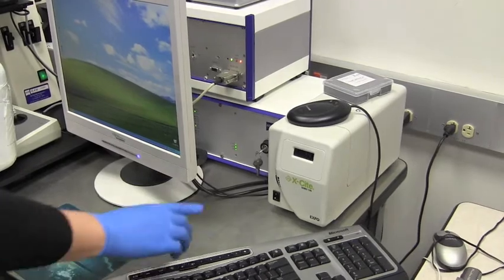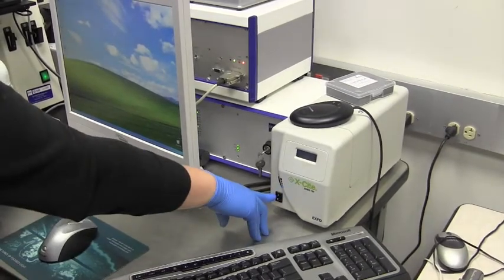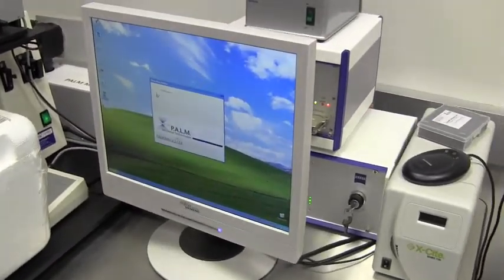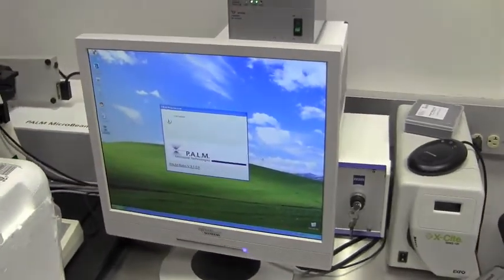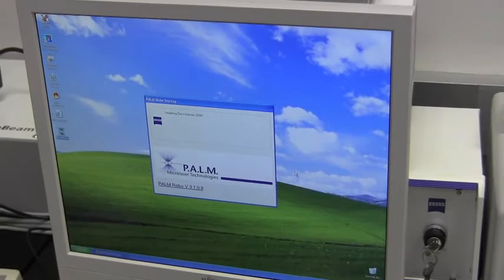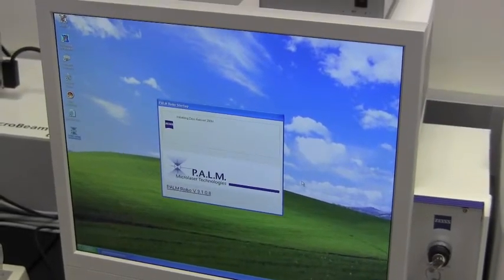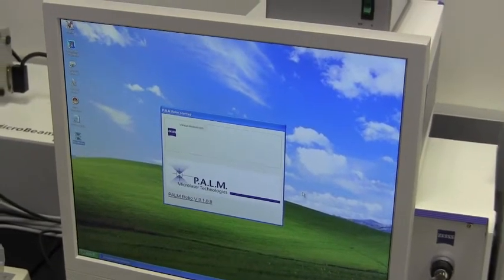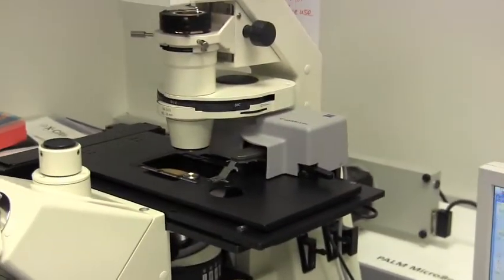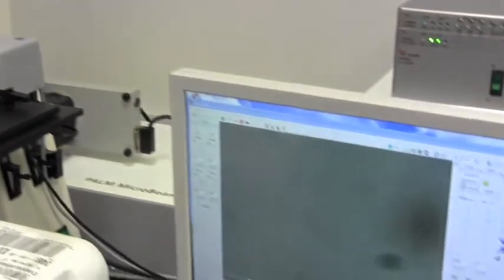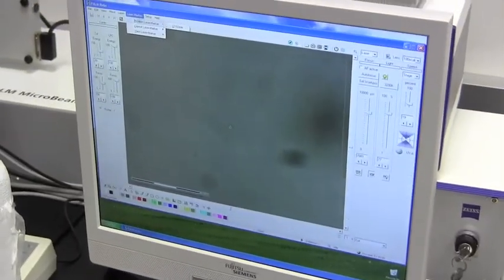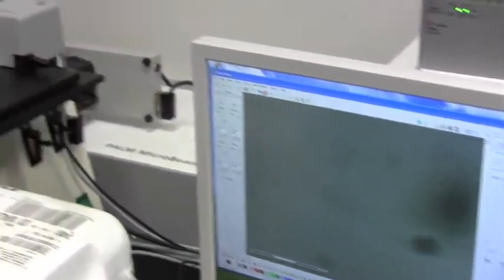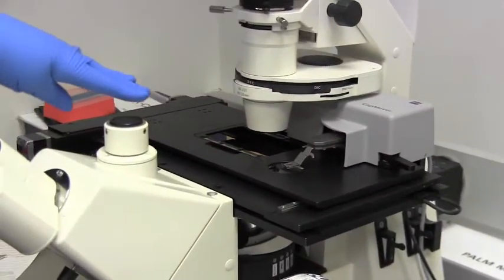For imaging, we'll be using this transmitted light, which you should turn on before you start. You start the Palm Robo system. The microscope will initialize and the objective will lower. And then it will lower again for the stage to move.